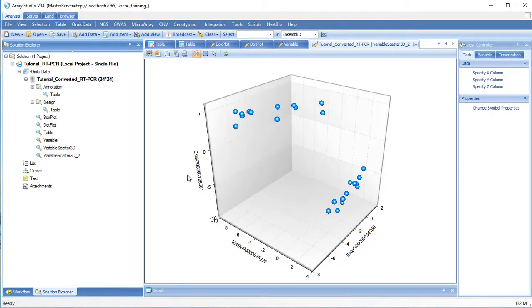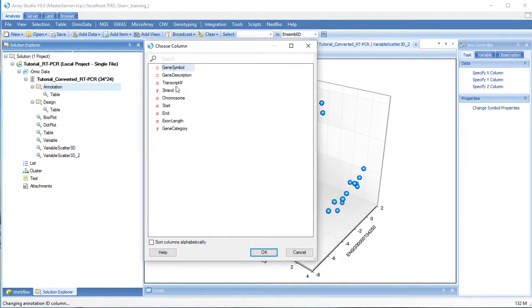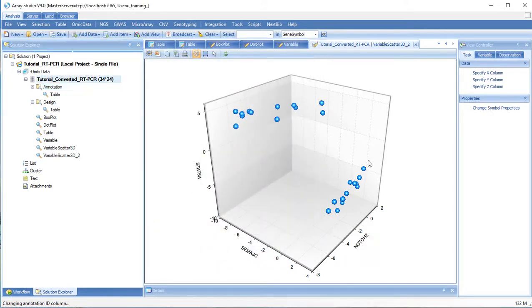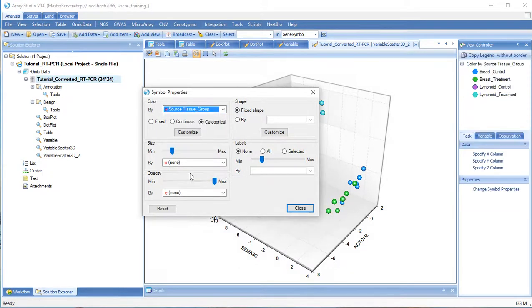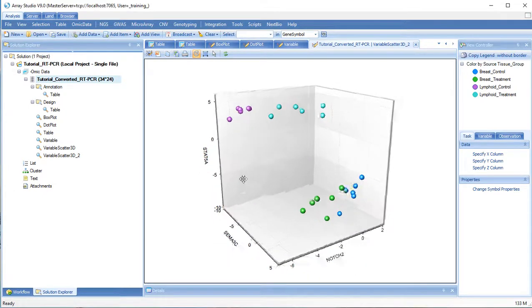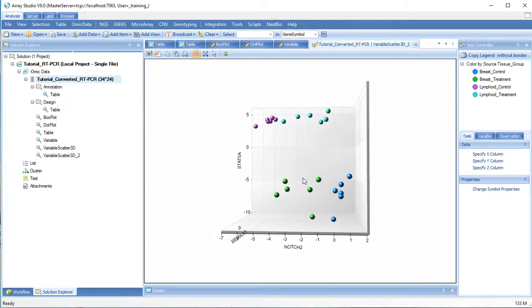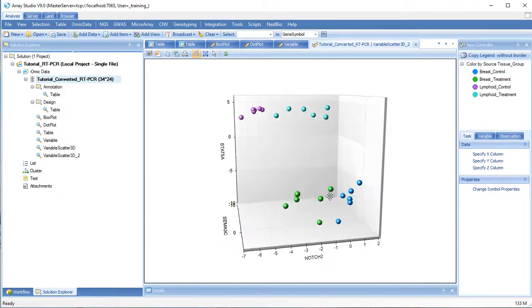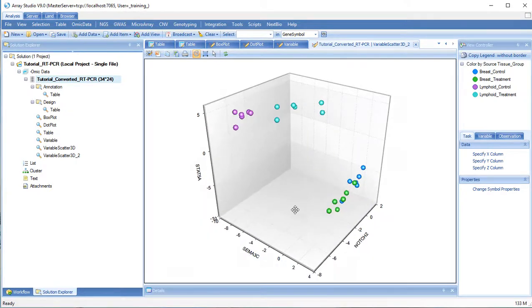Here, to view the gene IDs, we will need to change our ID column. Here we can see how each of these 3 genes changes its expression between our sample groups.